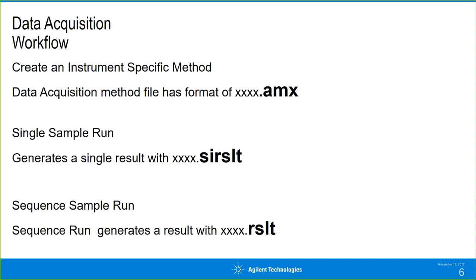If you're coming from ChemStation or if you're coming from EasyChrome, you'll notice that some of the suffixes are different. And what I'll try to do is address all of these suffixes so that you have an idea of what the different file structures are happening in the background, which will really overall help you understand the flow of what's going on with the data side of the software.